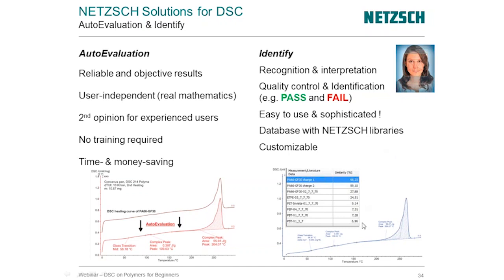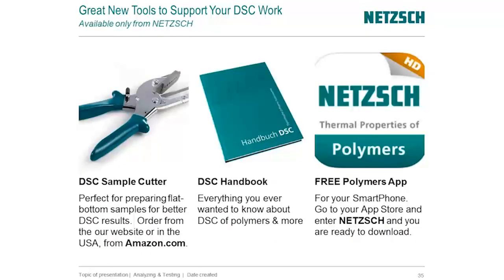So you can see this determines that this particular material is most likely nylon 6.6, polyamide 6.6, based on its characteristic trace. It's got a 96% likelihood that it's polyamide 6.6. And you can also use this then to set up pass or fail criteria. So I think that's really useful in the area of quality control and identification. So if your curve matches, you can set windows or limits that it should match within this range. If so, it passes. If it doesn't, it fails. Really cool.